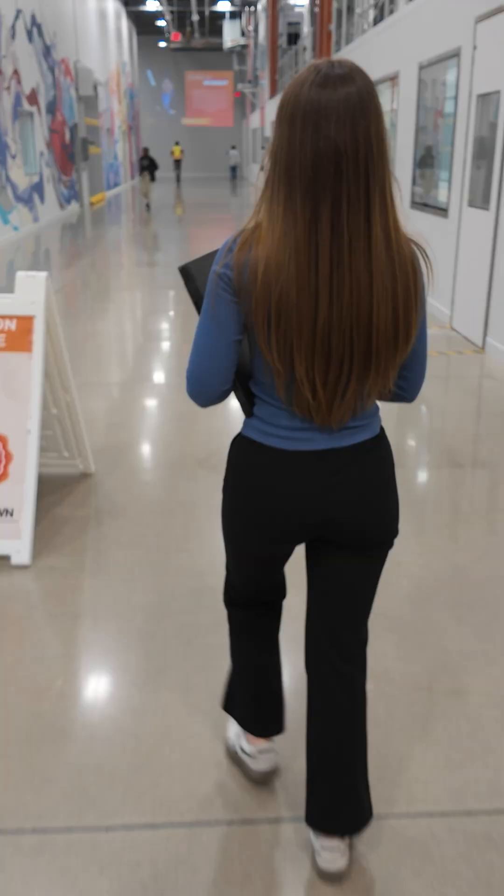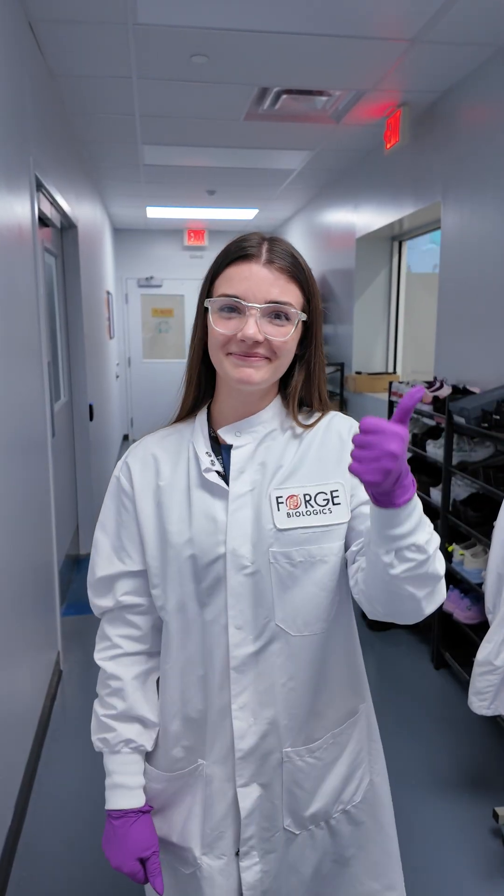When I go into the analytical development lab, I put on my lab coat, safety glasses, shoe covers, and gloves. These purple ones are my favorite.